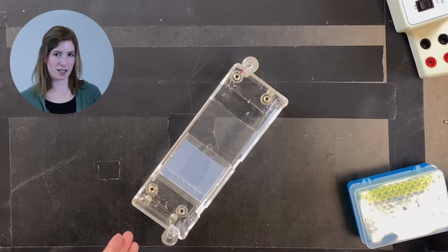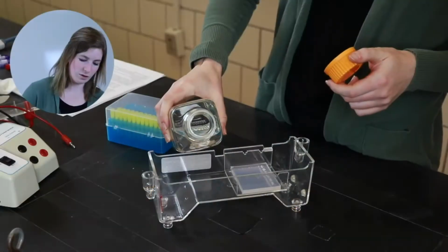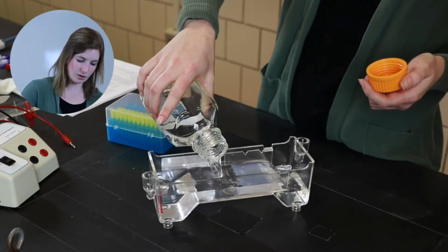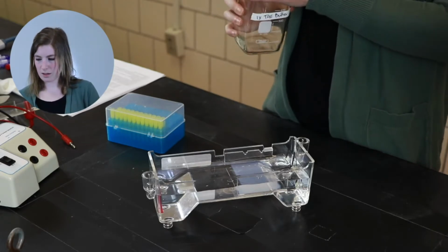So now that I have this in here, I'm going to put my buffer in. This buffer is also what is in the gel. And this needs to get put into the gel box in order to do this lab. So you need to just pour the buffer in so that you have enough so it covers the gel completely. So I have my gel in there. I took the comb out so that I have actual little holes to load my sample into, and now I'm ready to load my samples.